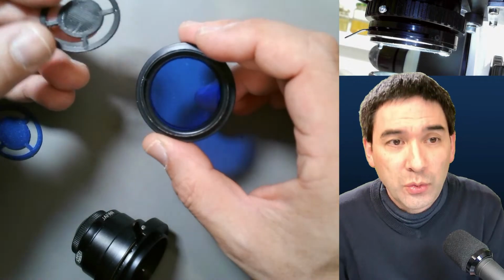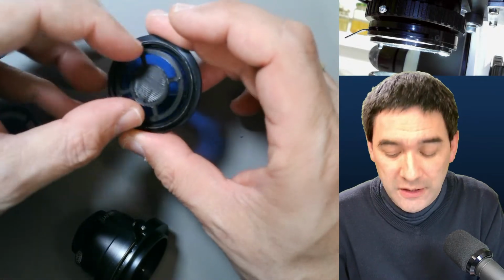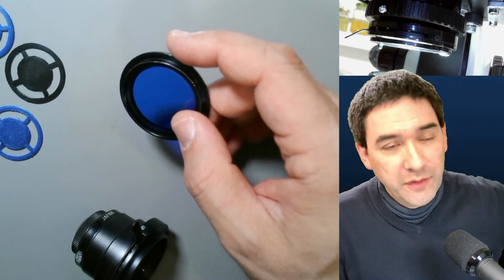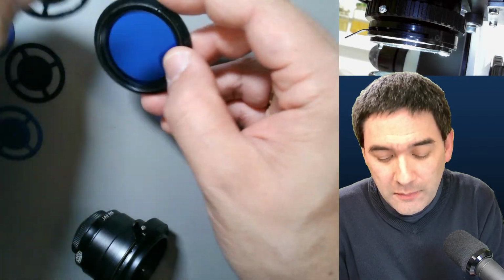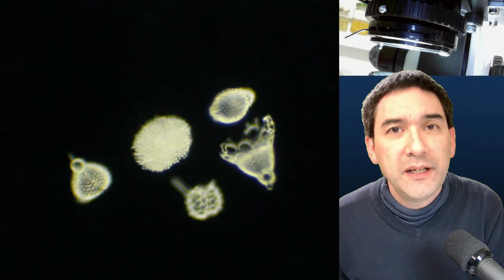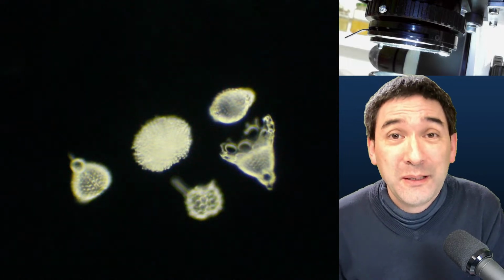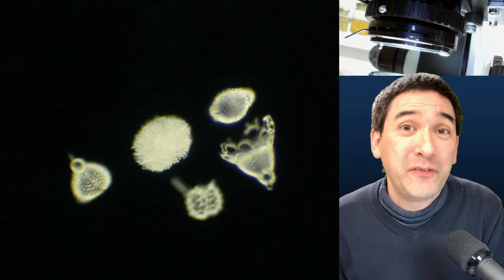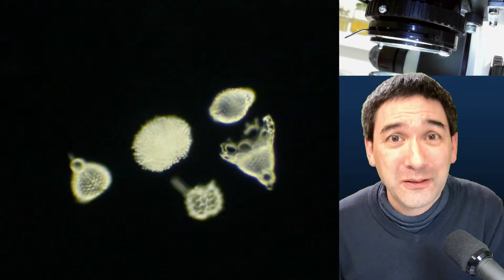What I've got here is a so-called dark field filter, a dark field patch stop. You can see that it's a little too small for this one over here. I've actually 3D printed several of those as well, in the other box, which can be placed in here. When you add a dark field filter, you get an image that looks like this. It's a bright image on a dark background, but not always. That's the point of today's video: to show you a couple of specimens where this works very well, and also a couple of specimens which are totally not suitable for dark field microscopy.